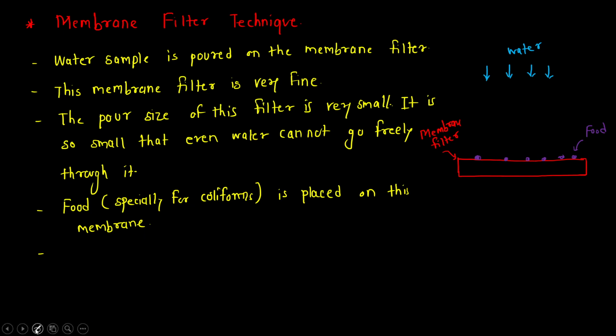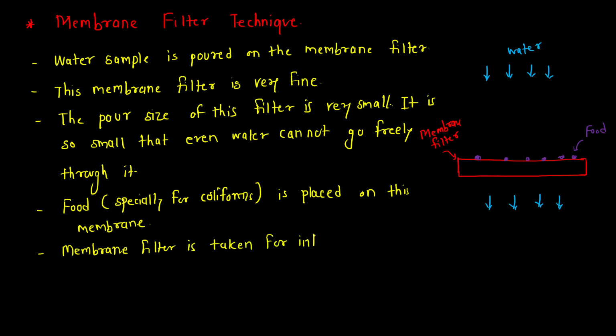Once the desired amount of water passes through this membrane filter, it is taken for incubation. Okay, this membrane filter is taken for incubation.